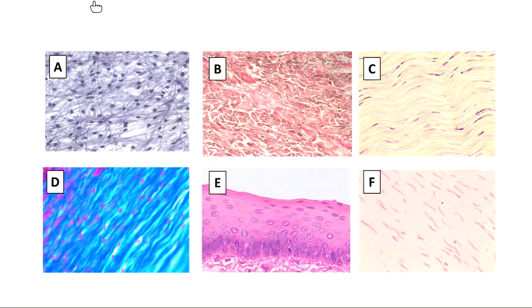So if you click on that T, you'll see a colored circle, pick black. Let's go through, type the names of these tissues above them and the names of these ones below them. I know we're going to type all over there, but go ahead, everybody here in class, pick a type of tissue and type its name for me. What kinds of tissues can we recognize here?